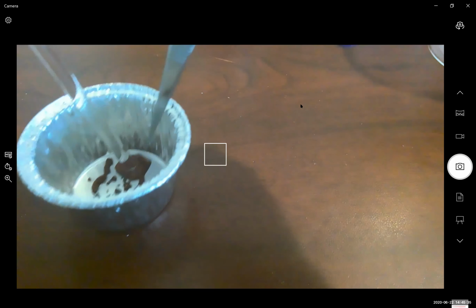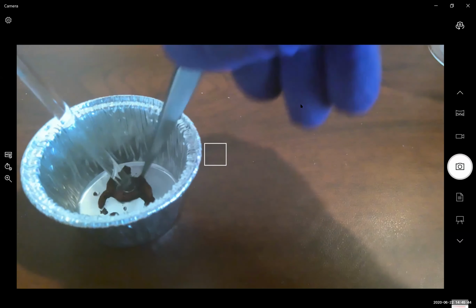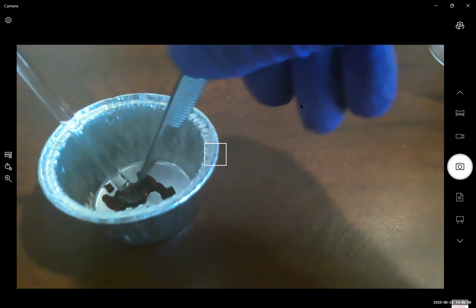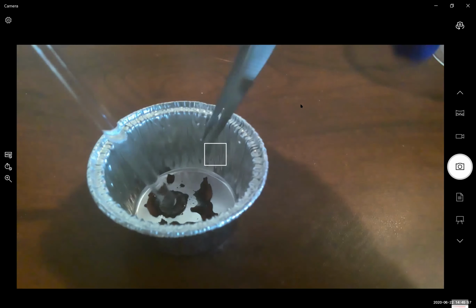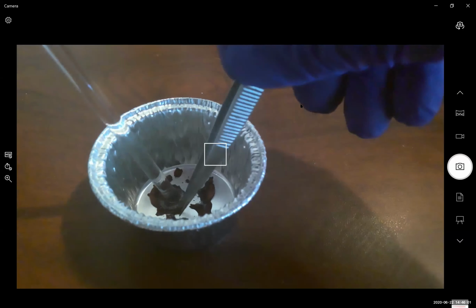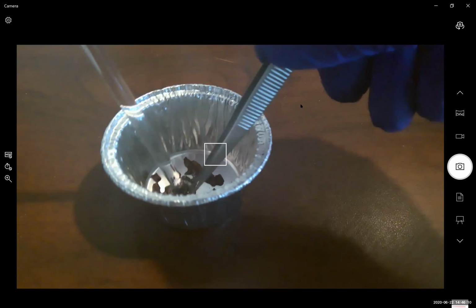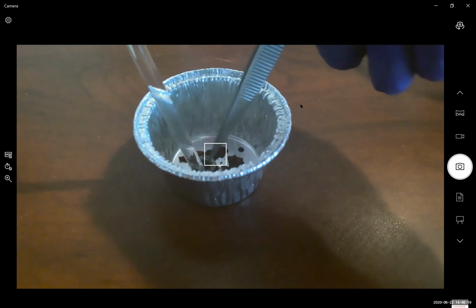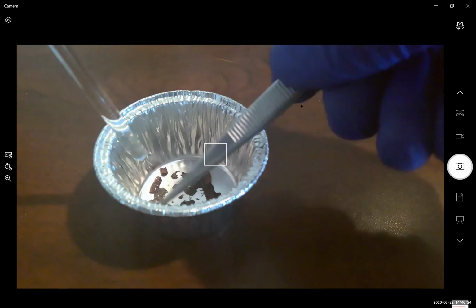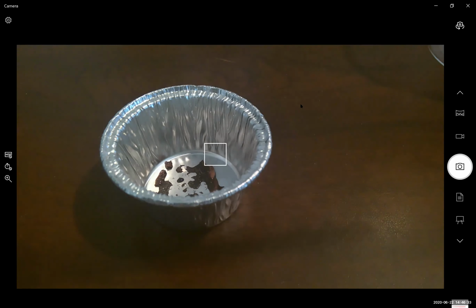Okay, so now let's take our second aluminum ring and scrape the copper off of that too. You want to get as much of it as possible for an accurate result, but it's home chemistry and this is not a quantitative transfer method. So you just want it to be as perfect as you can get it. Okay, so we've cleaned off the majority of our copper from our aluminum pieces.